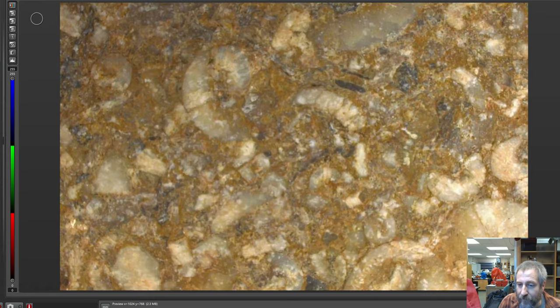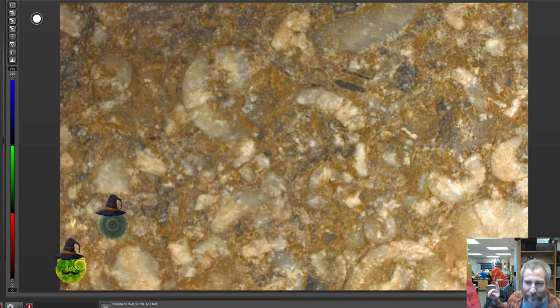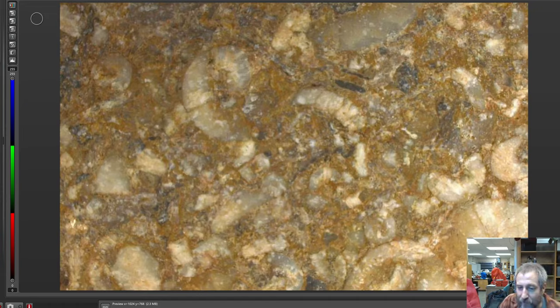If you look right here, if you're watching my finger, that blue blob back there in the background is actually a Leica Primo Star, which is the type of microscope that Pacific Plankton streams from. And I've got two of those. One is here and one is in Dr. Yost's lab. That's identical basically to the one that she has, that blue cover right there. So I've got five nice light microscopes in the lab.